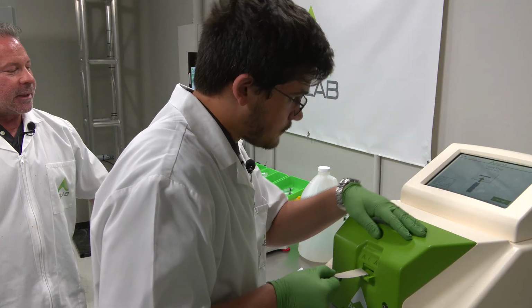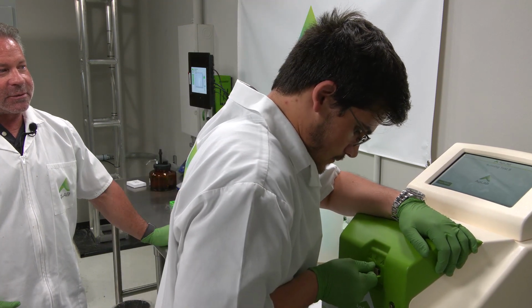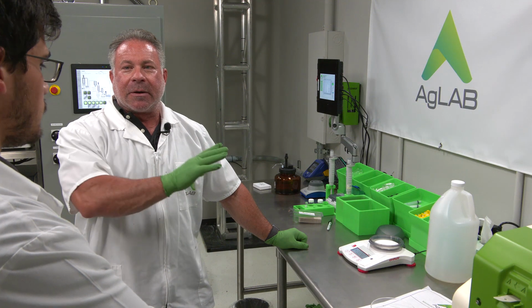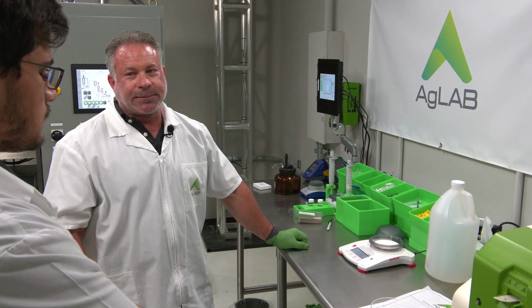Oftentimes people are looking at their run times in just strictly time. How long does it take me to do something? And so they oftentimes will just run as fast as they absolutely can. So generally, if you use your evaporator temperature first, that's an easy way to go about it without adjusting your feed rate at all. I see. Keeping a high feed rate if you need it.